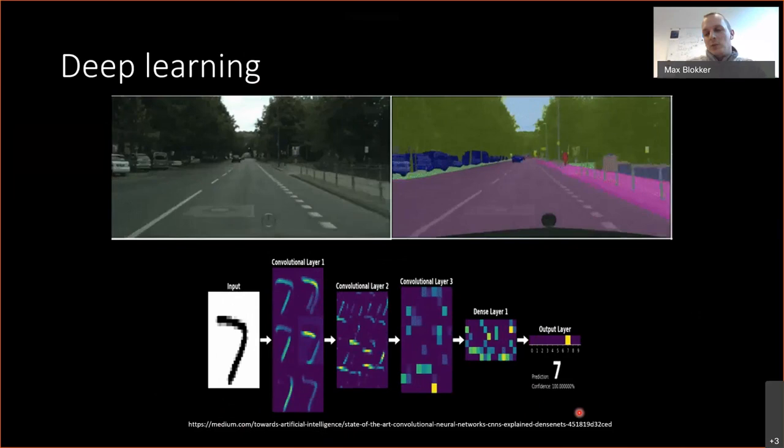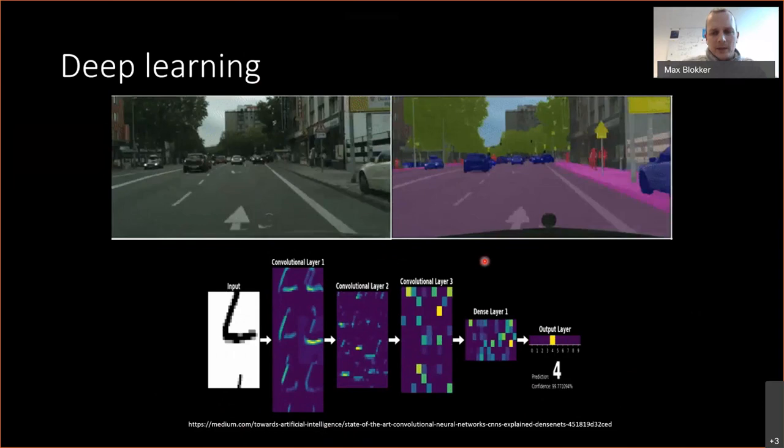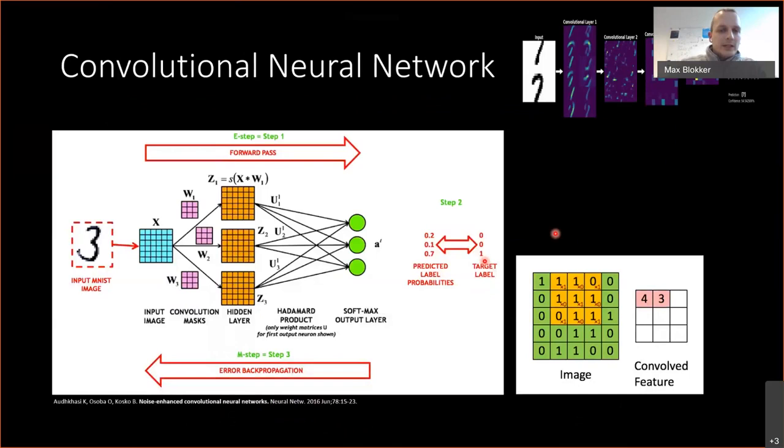And this is all thanks to algorithms called convolutional neural networks, which consist of several stacked layers that execute a convolution operation. These layers are chock full with weights, as shown here in pink and here in yellow. They slide across the input image, and convolution is applied between the pixels and the weights. In this case, in green, we can see our image, and in the down right corner are the weights of the kernel, which slides across the image. A feature is the result of this convolution operation. And there can be loads and loads of these kernels in a single network.